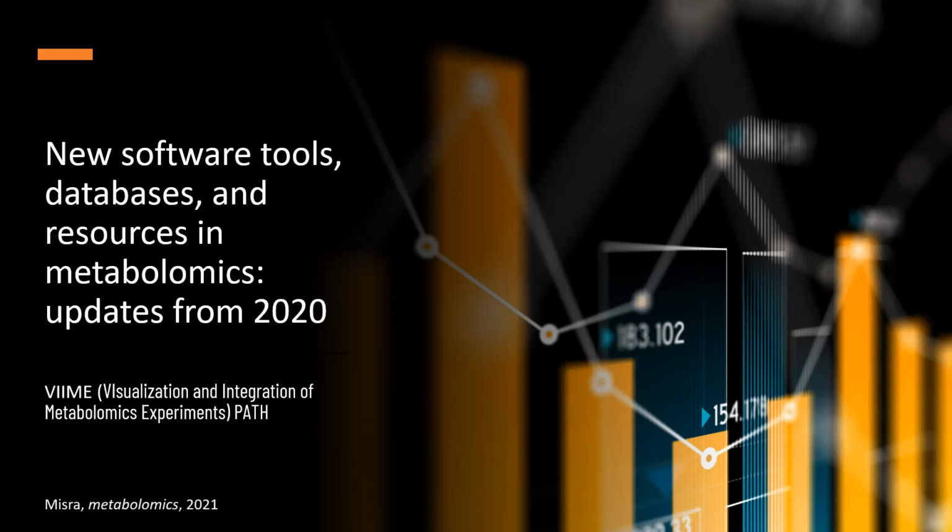Okay, so I'm presenting from this paper. This is the title of the paper, New Software Tools, Databases, and Resources in Metabolomics: Updates from 2020. So this paper came out in 2021. If you have the opportunity, you can have a look at the paper. You can also find other tools in the paper. So today I'll be presenting on VIIME. I call it VIIME, and it stands for Visualization and Integration of Metabolomics Experiments.